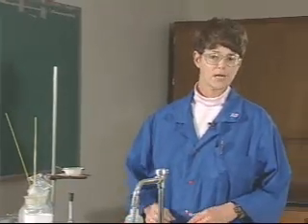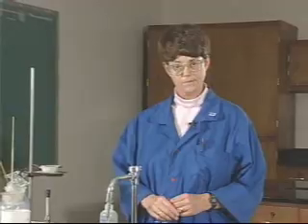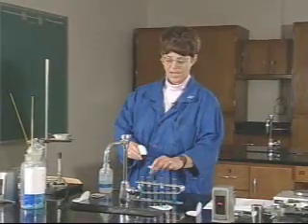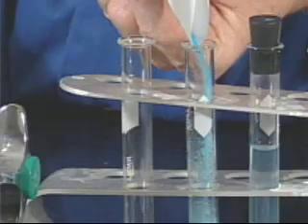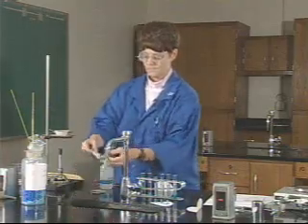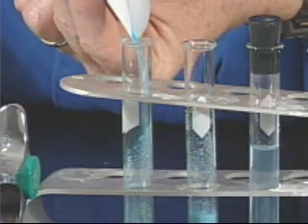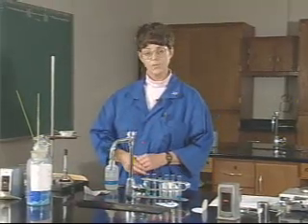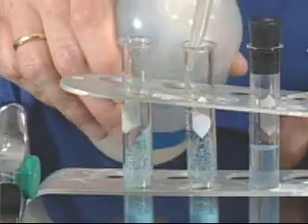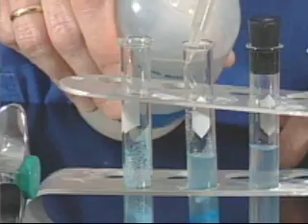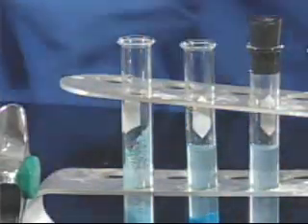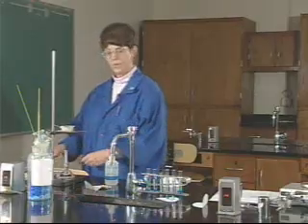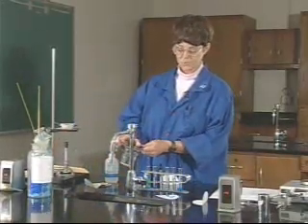The third factor we're going to look at that could affect the rate of solution is temperature. To take a look at this factor, we are again going to use the powdered form of the copper sulfate, and we'll add powdered copper sulfate to each of two tubes. To one of these tubes, we're going to add cool water, and to the other, we're going to add some hot water from the hot water bath that we used for Part A. I'll fill both approximately half full. The beaker with the hot water will still be hot, so you want to use tongs and make sure that you don't spill any of the hot water on yourself.